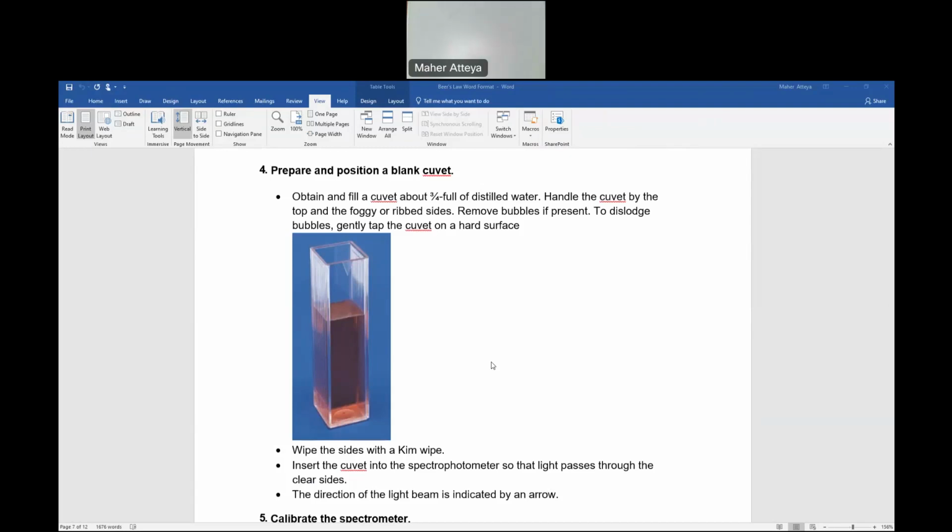Those 2 chemicals you have, they kill the kidneys and the liver. So we don't want to put them inside the sink. If they are not trapped inside a trap, they skip the trap. Every chemical lab has a trap, the sewer. But if they skip, they go to the fish, the rivers and the ponds. If that happens, they kill the fish. And make sure that you clean your hands very, very well today. You don't want any traces on your fingers and then start eating stuff. Cobalt and nickel are heavy metals.